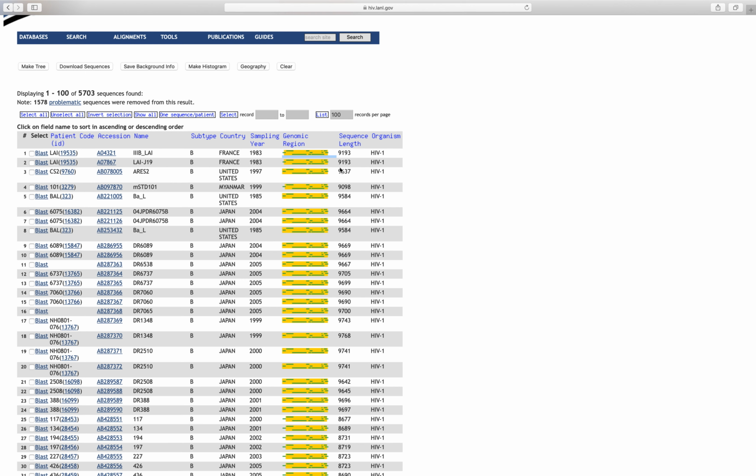In general, most of these sequences will have a pretty complete amount of the 3', and then different sequences will report different amounts of 5'. We'll talk about that. And then another quality control step, for organism, we see here that all of these sequences are HIV-1, and that's what we want to see because we, again, asked the search engine in the database to return these values.